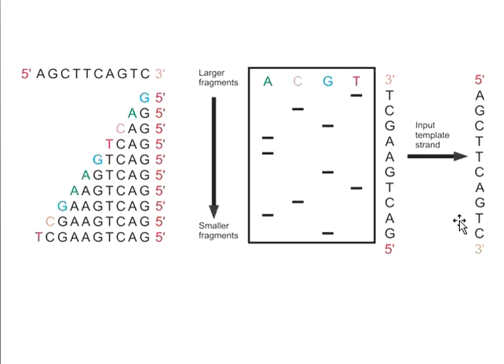Sanger sequencing mainly involves the use of dideoxynucleotides, which cause DNA synthesis to terminate due to their lack of a 3' OH group. I hope you have understood very well about Sanger sequencing and the principle behind it, that is the absence of the 3' OH group.